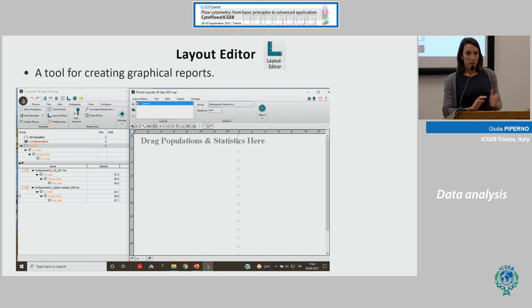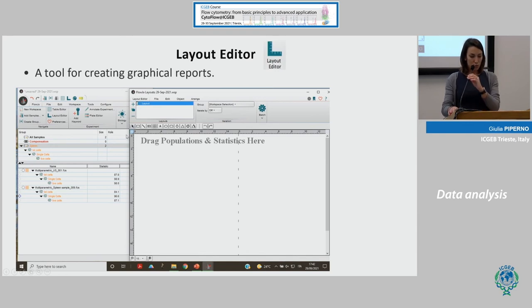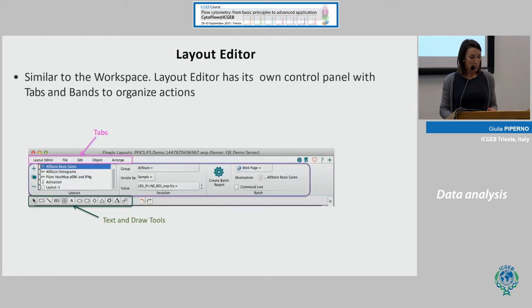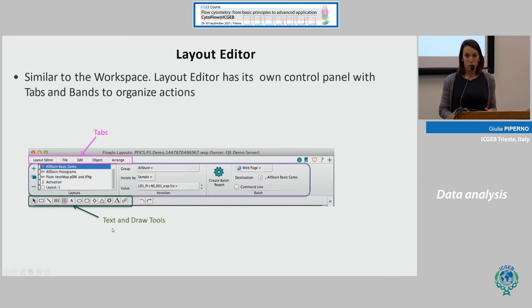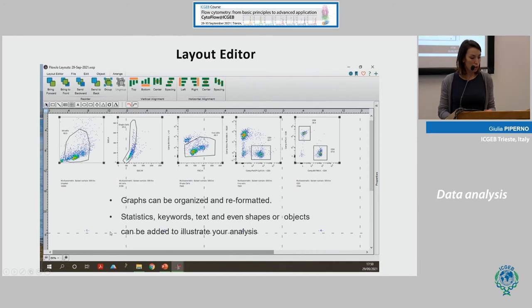After creating our gating strategy and analyzing our data, we can view everything together by opening the Layout Editor. Layout Editor is a tool to create graphical reports. Click on its icon in the upper part of the workspace. Layout Editor, similar to the FlowJo workspace, has a control panel with different tabs and bands. You can add, delete, or duplicate layouts, and use text and drawing tools. Graphs can be organized and reformatted here.